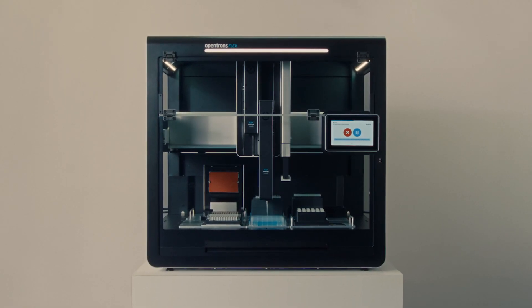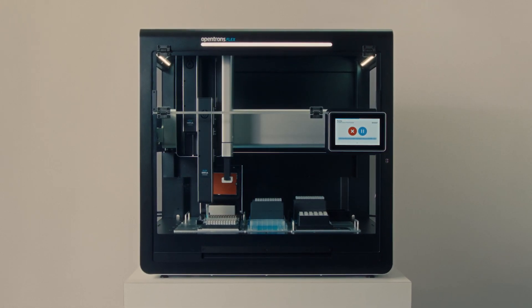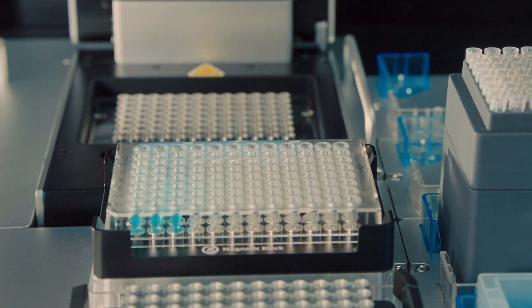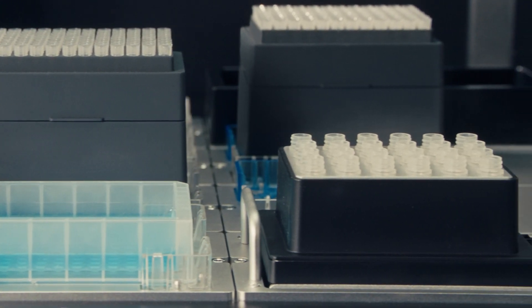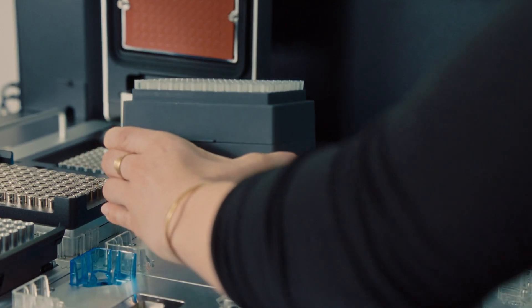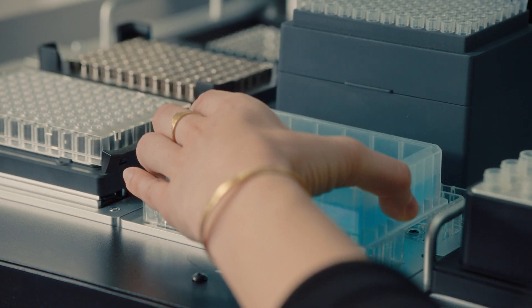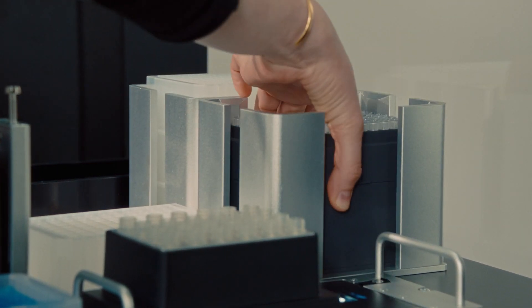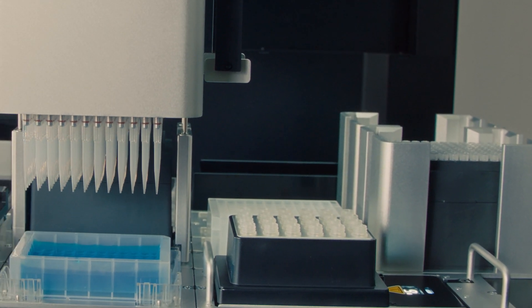In a really common genomics workflow like NGS library prep for example, you can have a thermocycler, a heater shaker module, magnetic module for the cleanup steps, as well as a temperature module to actively cool your enzymes or primers, and then have the required tip racks and reservoirs for additional reagents. In addition to the 12 deck slots there are four additional slots that can house tip racks and reservoirs that can help increase the capacity of the platform.